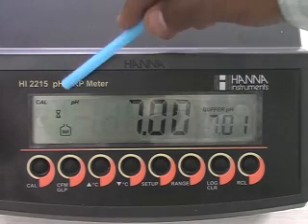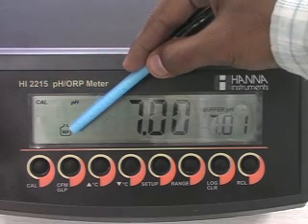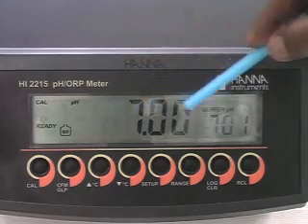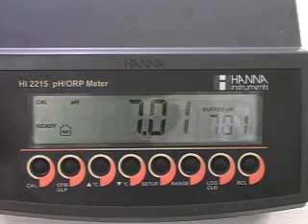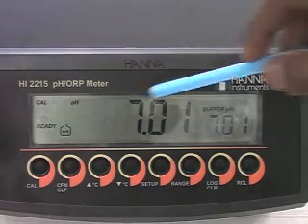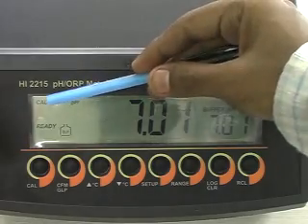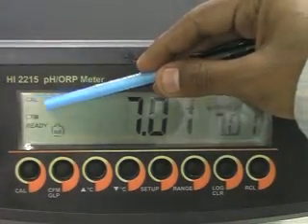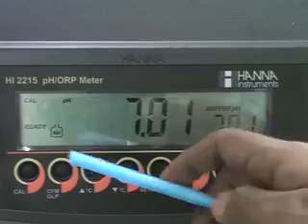The CAL and buffer tag will appear on the display, and 7.01 will display on the secondary LCD. When the reading is stable and close to 7.01 pH, the instrument will display ready and a blinking CFM tag. At this time, press the CFM key to confirm the calibration.